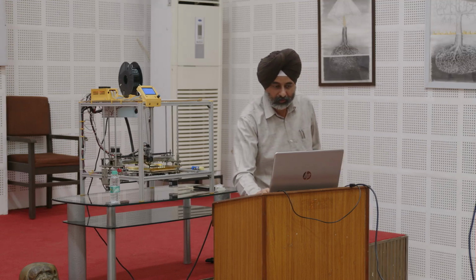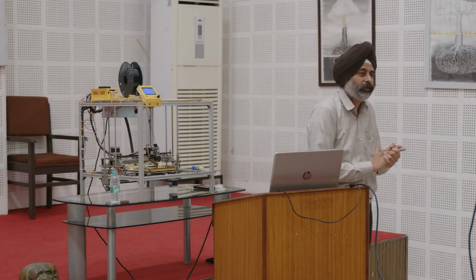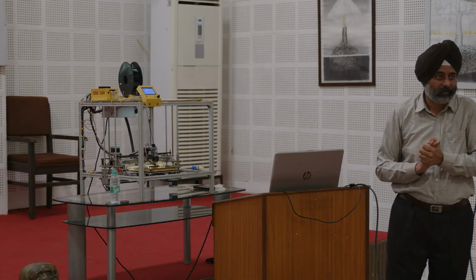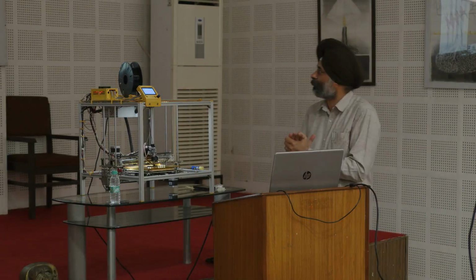Now with this background, we can quickly have a recap of how electromagnetic radiation works. So you have electric and magnetic fields. Then if you have closely spaced conductors in the path of this beam, the electric field along the conductors will get absorbed.